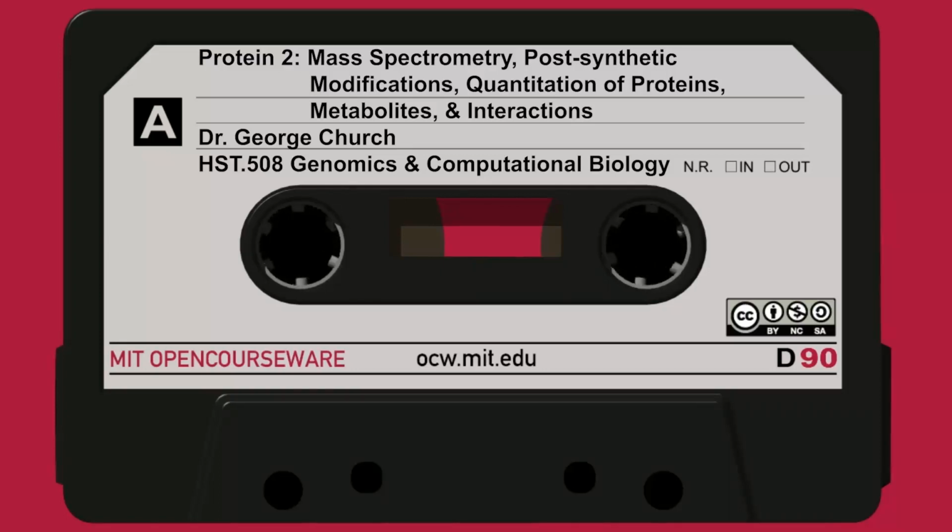We have the hydrophobic tendency of any given peptide is going to be related to the sum of the individual amino acid components. Now you can either have isocratic elution, where you have basically constant migration speed, no change in the content of the mobile phase, or you can have the mobile phase change its composition, say from something that's almost entirely water at the beginning, to something that has a high organic content, up to 40% or so acetonitrile. And so at the end of the gradient, even the most hydrophobic peptides now have just as much affinity for the mobile phase as for the solid phase, and they come flowing off.